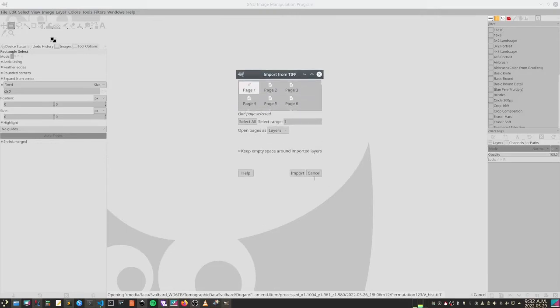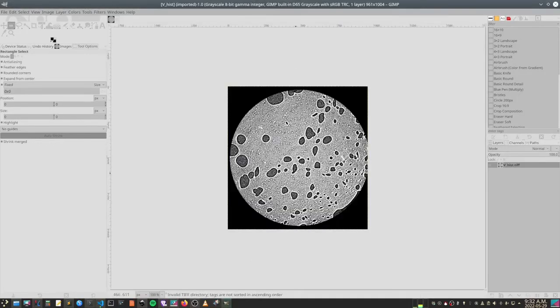If you just choose the first one, on the lower left side here you have the pixel values where you're pointing at, so it's an easy way to find pixel values. Say what I had as an example was 200 by 200 here, and the lower right hand side corner is 800 by 800, so basically we're selecting this region.